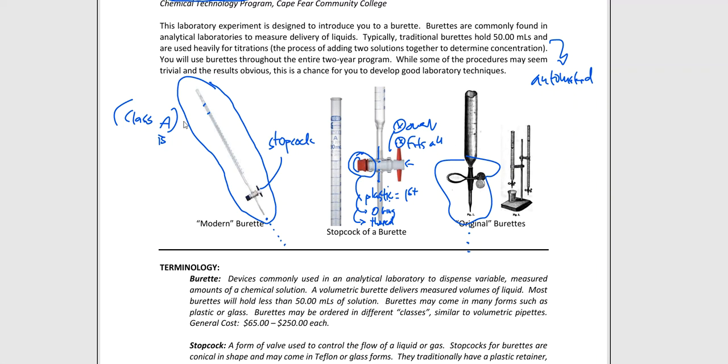But if I am titrating like 100 samples, maybe I don't want to do this by hand, and the automated instrument can do that for us, and it can change the samples as well. So if I've got a carousel with like 30 samples loaded into it, I just tell the machine what I want and what I need to titrate, and it will take over and begin titrating all of those samples for me, one after one after one after one after one.